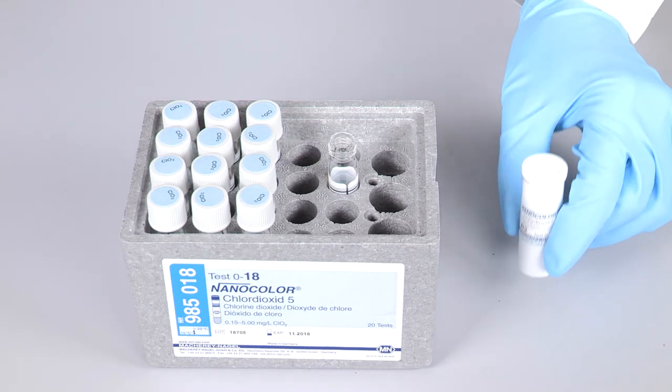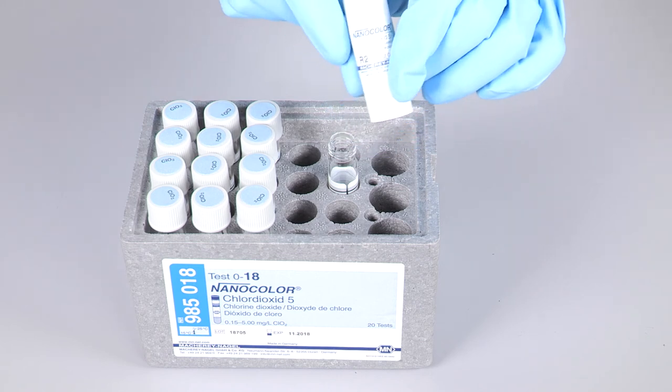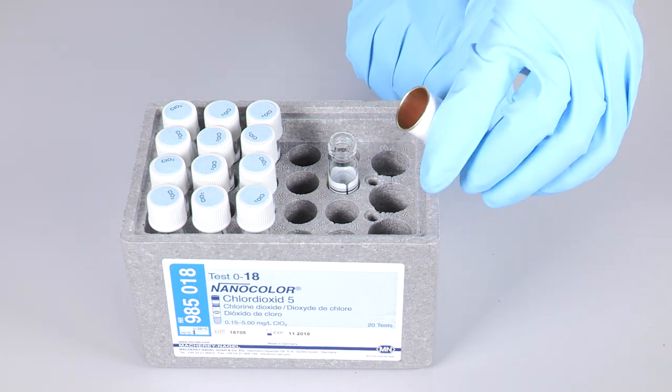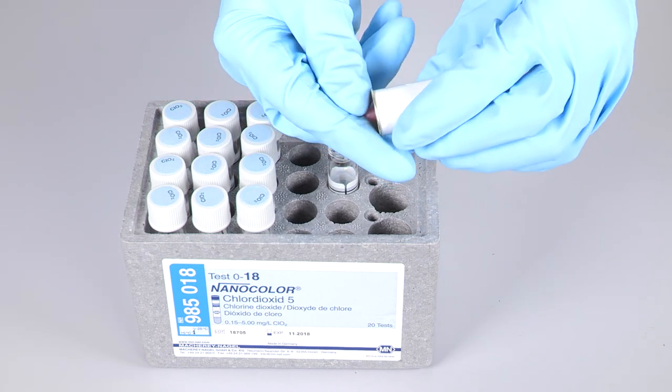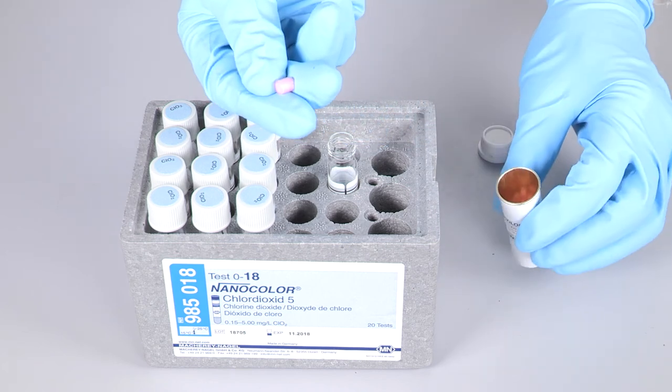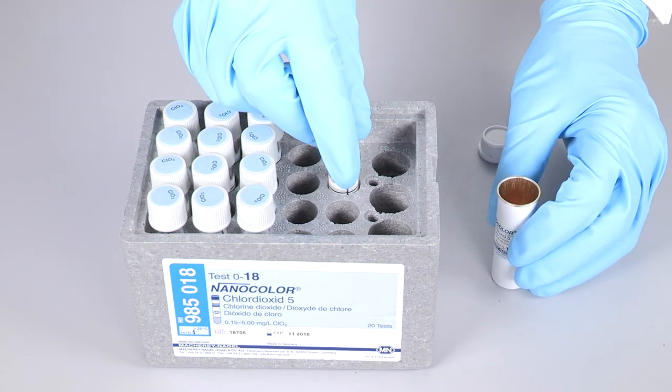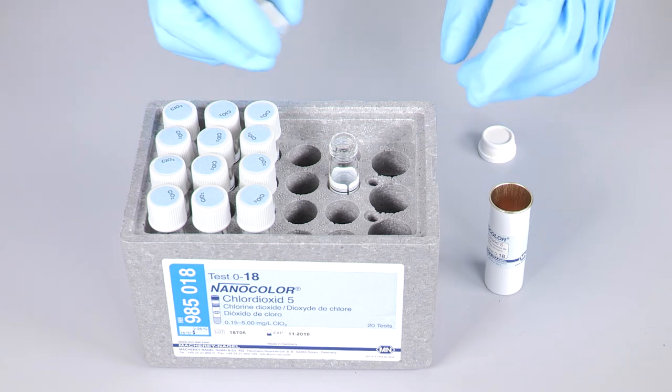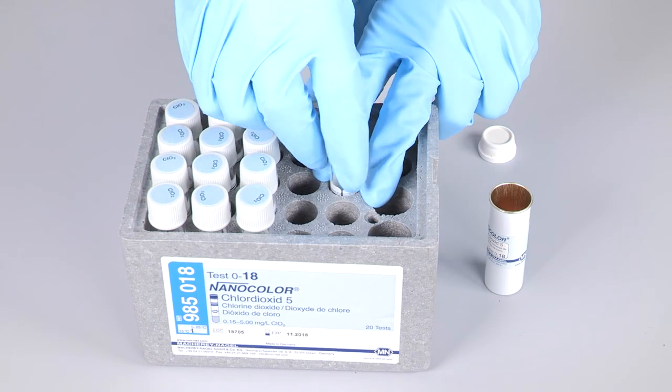As a next step we add the small tube called R2 into the cuvette and mix it with the sample by slowly turning it a few times. Ensure that there are no fingerprints on the outside of the cuvette or gas bubbles on the inside.